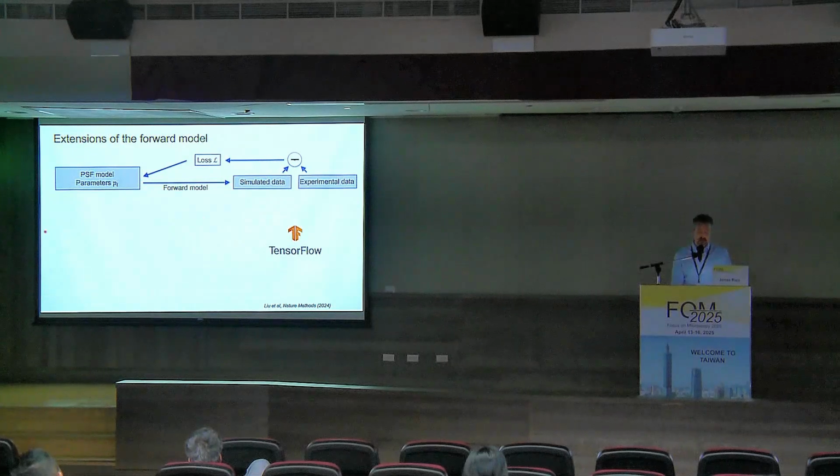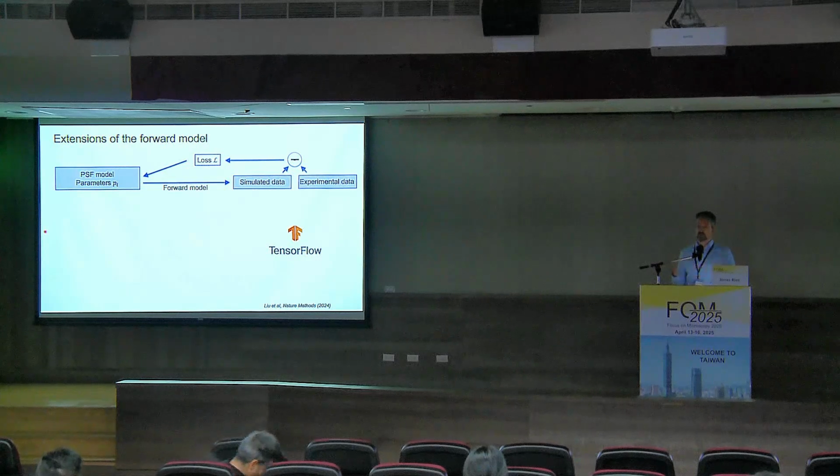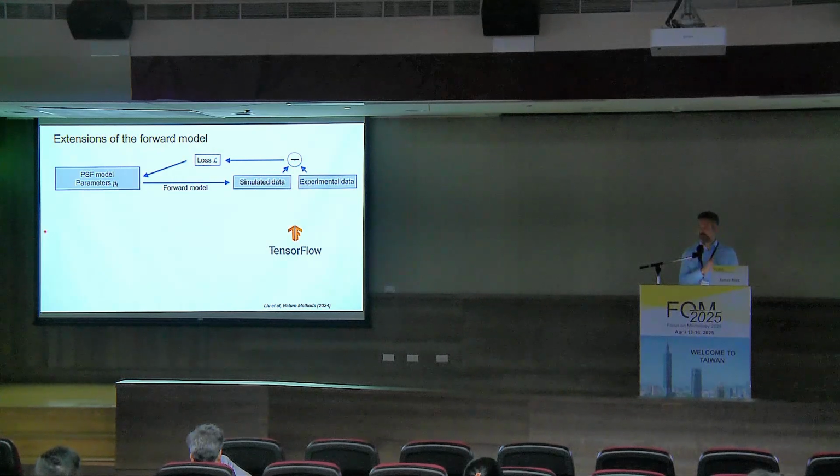We implemented UIPSF using TensorFlow. That's the platform, or one of the platforms used often for deep learning. But we don't use deep learning here. We only use the TensorFlow framework to do the automatic differentiation for us. And it can do so analytically, which makes it very performant. For us, it has the advantage that it's very easy to write the code, to write the forward model. We just have to literally put in the forward model. Everything else is handled by TensorFlow.